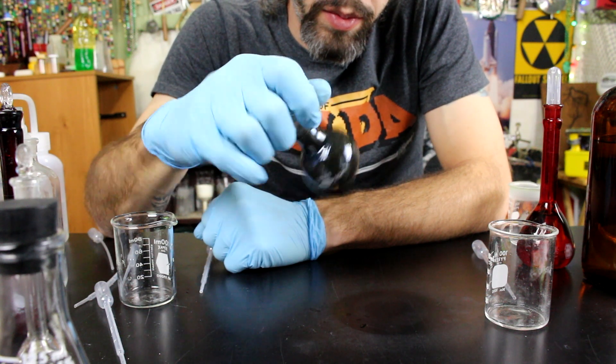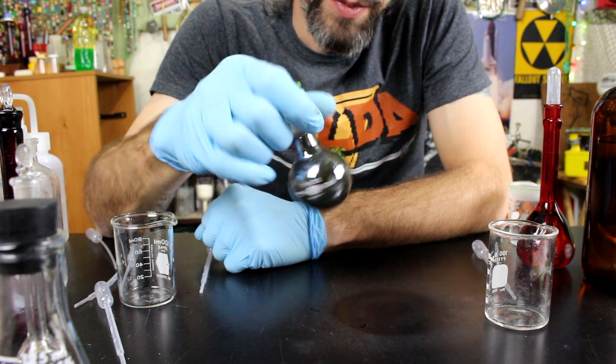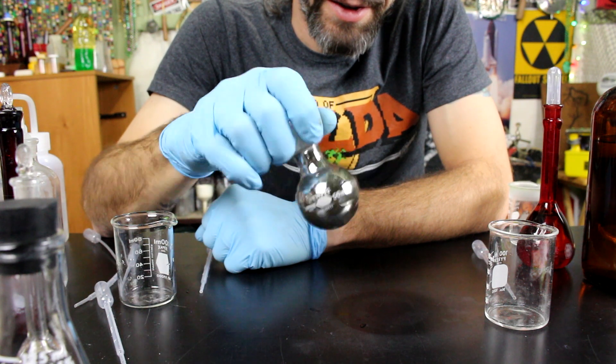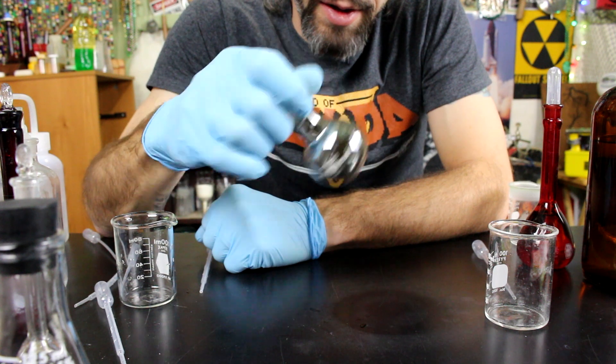So after some swirling and shaking, you're actually depositing silver on the inside of the glass. It's actually quite an amazing little reaction.